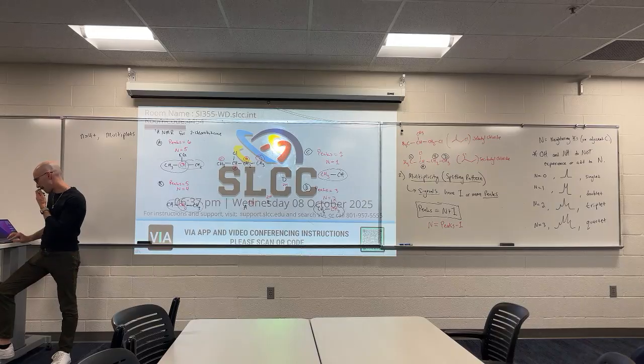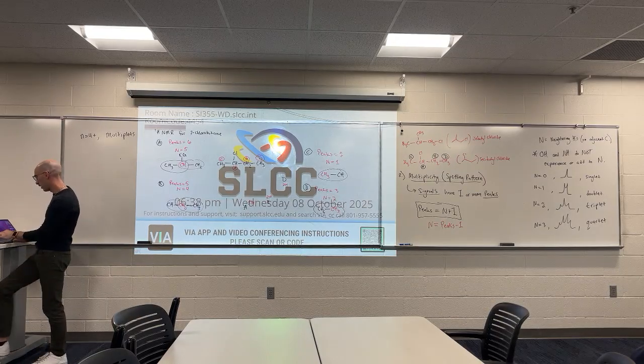I'm going to pull up an NMR spectrum, and I'll give you the chemical formula.